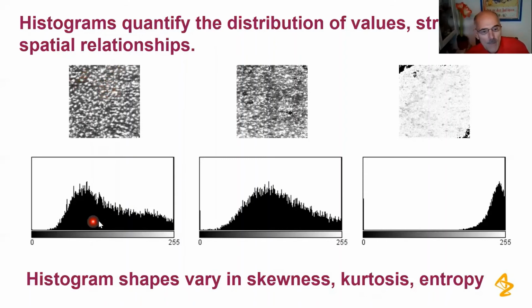So you're getting something on the way towards a bimodal distribution here, where you have both signal for the bright spots and dark signal for the dark places. So here's the bright spots and here's the darker areas. And then with the much more diffuse and smeared out image here, you get a more smeared out, broad peak.